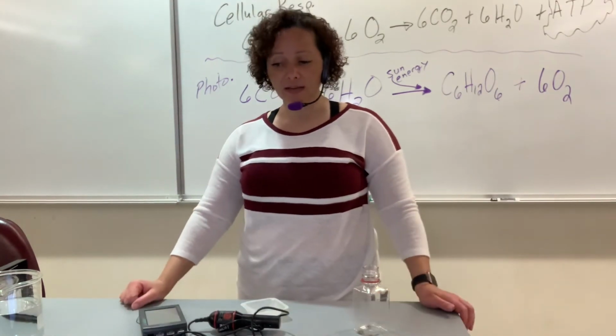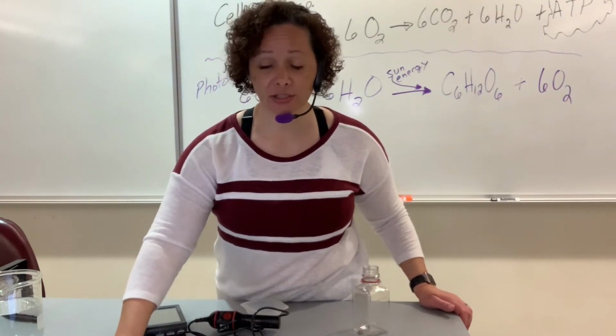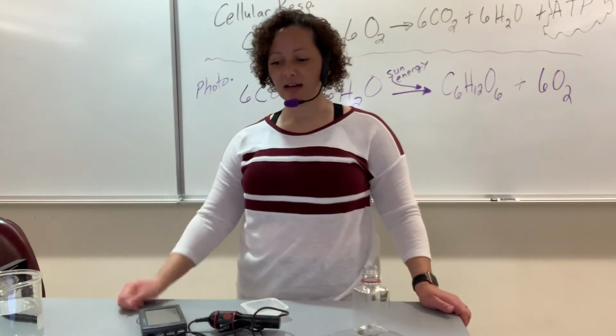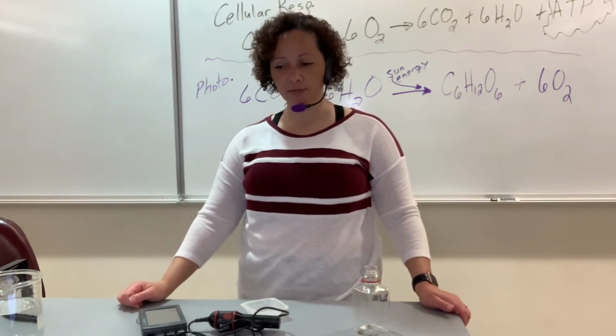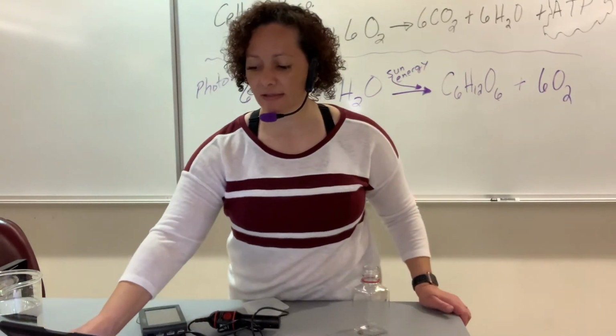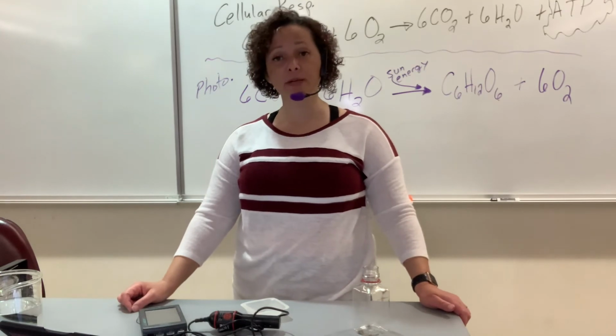So you will take that from your table 1, transfer that information there, the mass of those organisms. Then you will take the average slope, that last column from your table 2, and you will transfer it to that second column of table 3. Using the mass of the organism and the average slope, you are then going to calculate the average respiration rate.